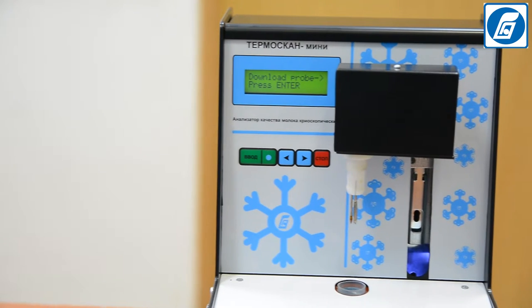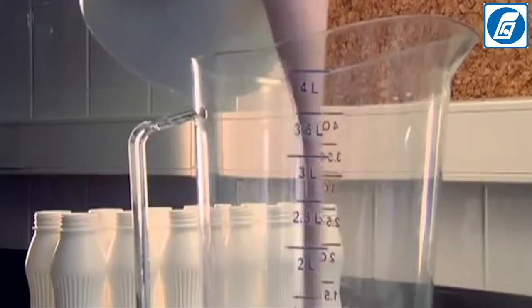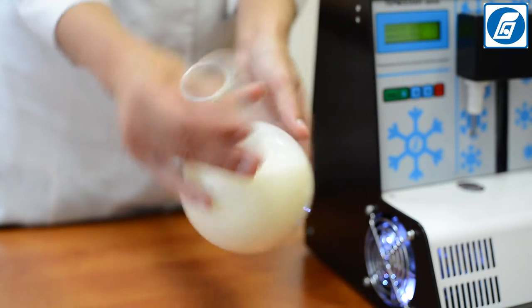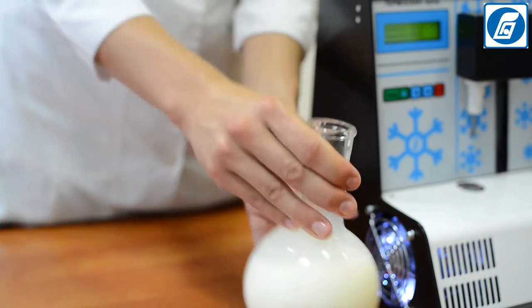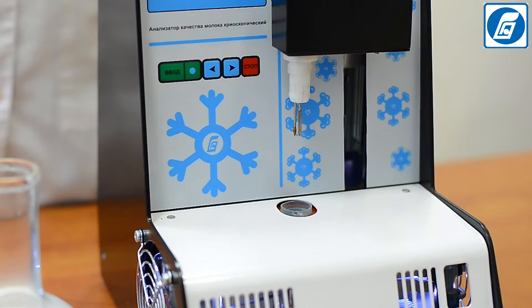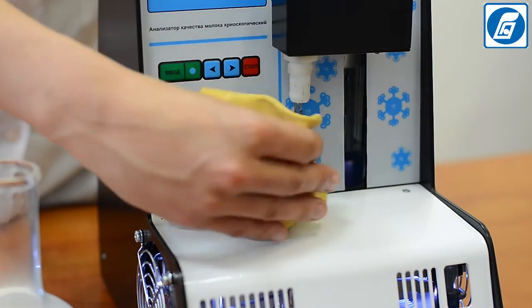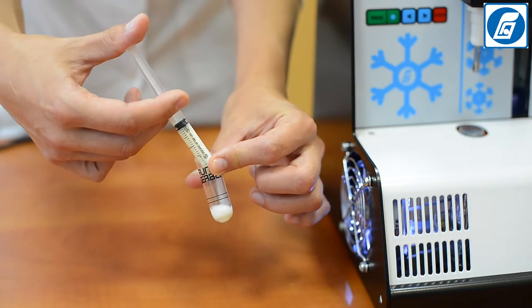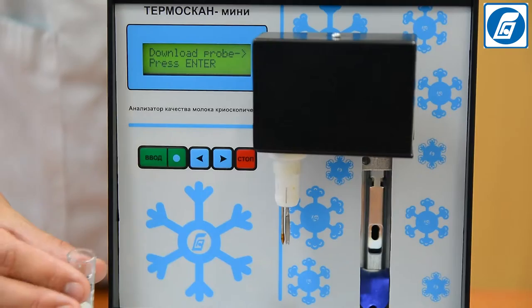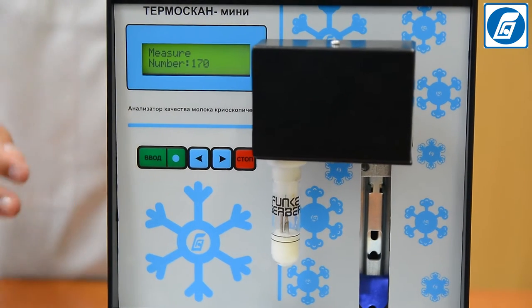We will now demonstrate how to test a milk sample for freezing point determination. Select and prepare the milk samples, preferably analyzing them immediately after selection. Carefully turn and rotate the container with the milk sample several times to mix contents. Milk temperature for analysis should be 20 ±2°C. Ensure the probe and hushing wire are clean and dry. Pour or transfer with a pipette 2.5 ±0.1 cm³ of milk into a clean, dry test tube, then place the tube on the holder of the measuring head, pushing it upward all the way.